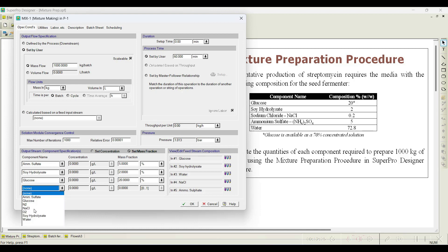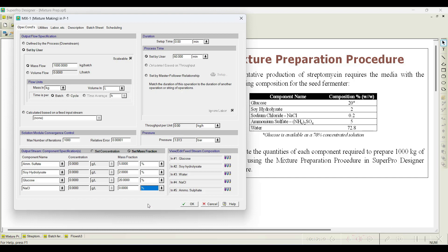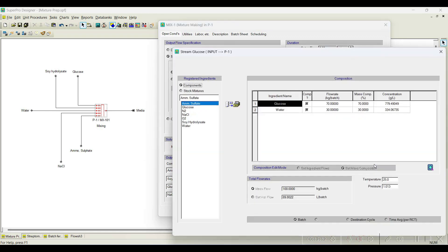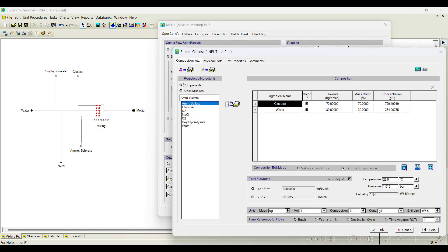Sodium chloride is 0.2% — select percentage and enter 0.2%. We have now fixed four components; the software will automatically calculate the remaining stream, which is water. If you forget to set any of these streams, you can use the View/Edit option to go back and edit the components.